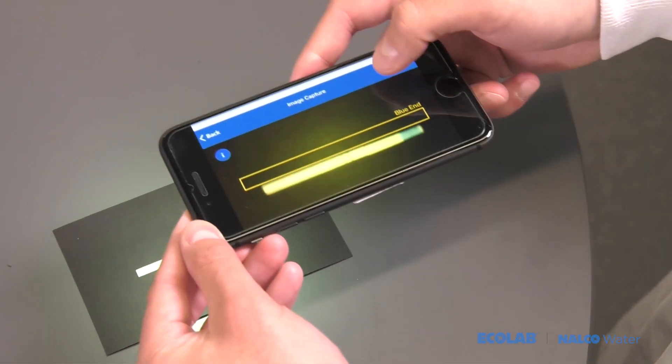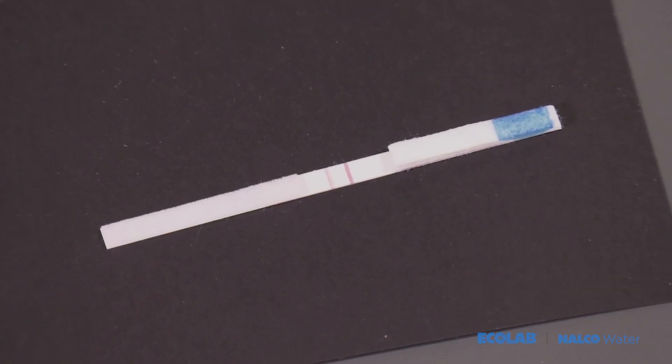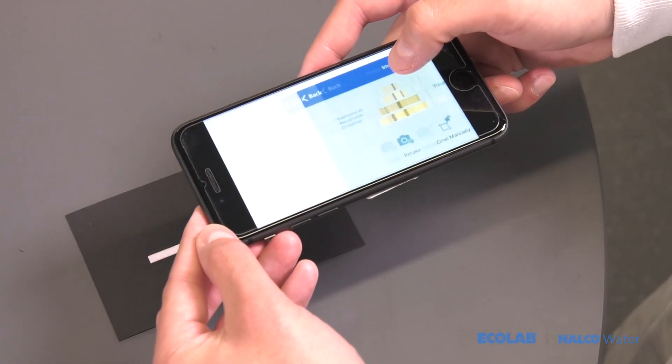Position the smart device above the test strip. Align the test strip within the display window box with the blue side of the strip facing right.